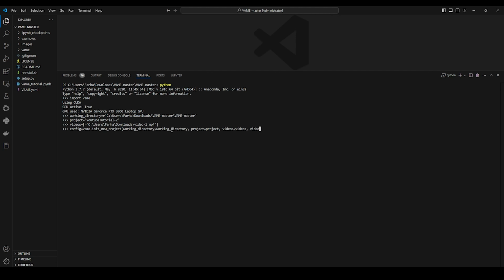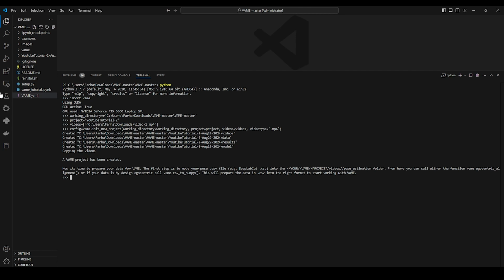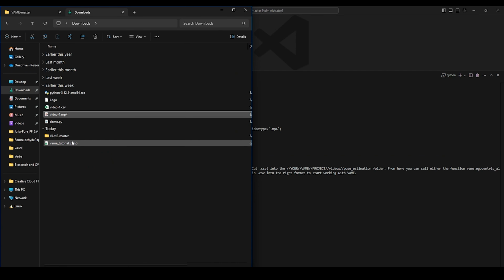And I also need to define the video type, which in my case is .mp4. Okay, now I'm using the demo video and the demo CSV data that is provided by the VAME GitHub repo. So here we have our project is created message, and this here is the project.